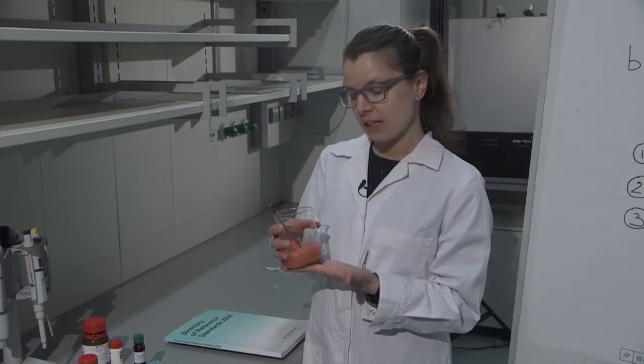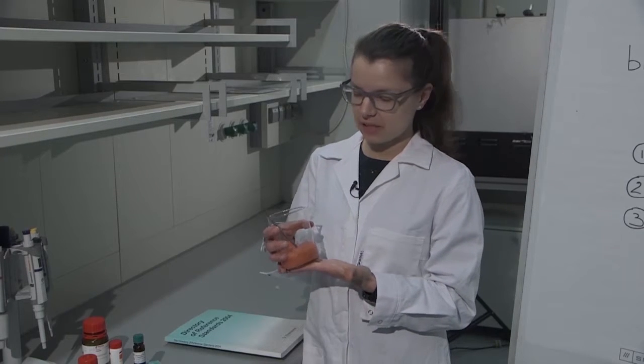The problem with this kind of sample is that you don't really know exactly this value with uncertainty, and therefore you can't be sure. And sometimes this value can actually be dependent on the method that you are using. So maybe if you are doing GCMS analysis, you can have one result, and if you are doing LCMS, it can be a second one. So it's not really advised to use that kind of samples.